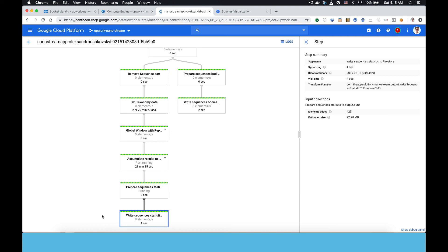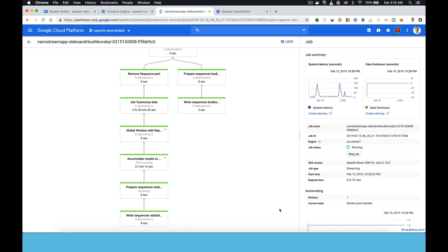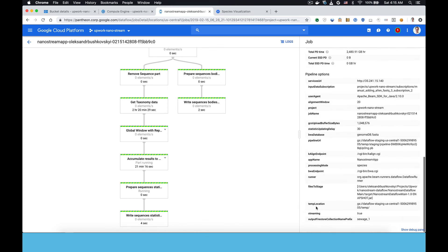And then we count up the number of times we saw each species and write that out to Firestore. And then Firestore is, again, integrated with the web visualization so that when Firestore updates, the visualization updates. And you can see that there's been 423 updates in this step over there on the right, which corresponds to the number of times the visualization updated. Here's just some general stats about how long it's been running.